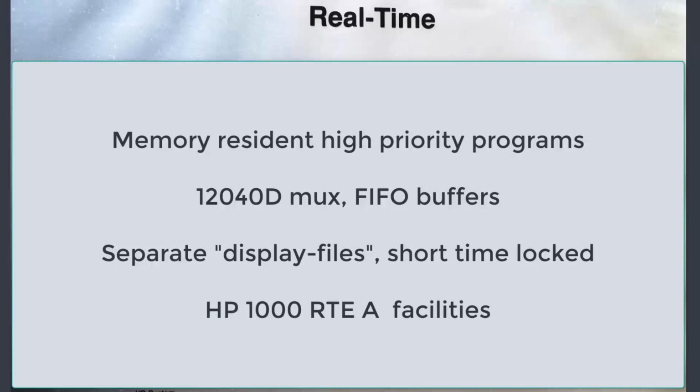Real-time operation of analyzer instruments was never a problem with the HP1000. However, short response time always in all processes was important in a laboratory environment. But to see how the system lives up to these requirements, let us see how the 1000 system was loaded.